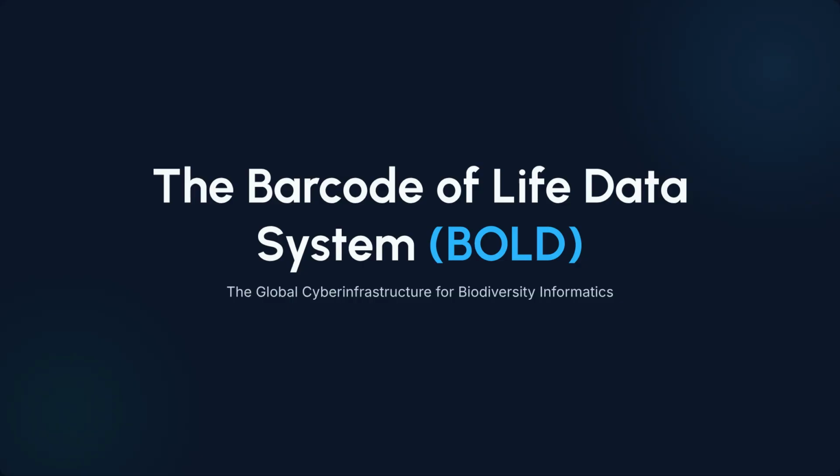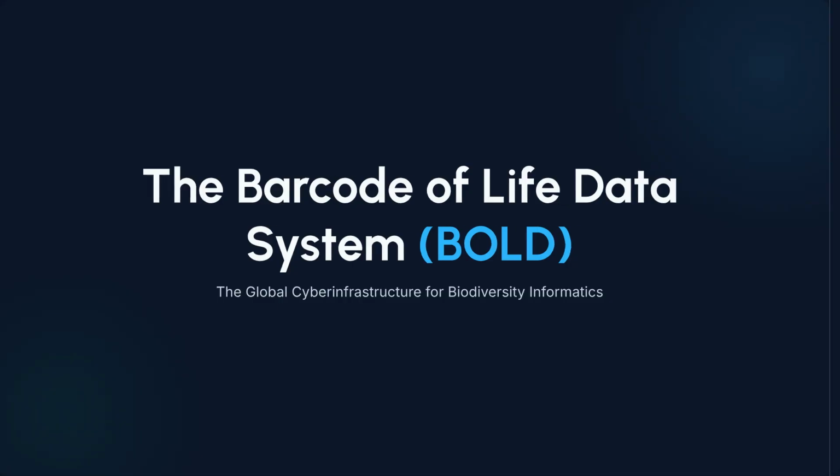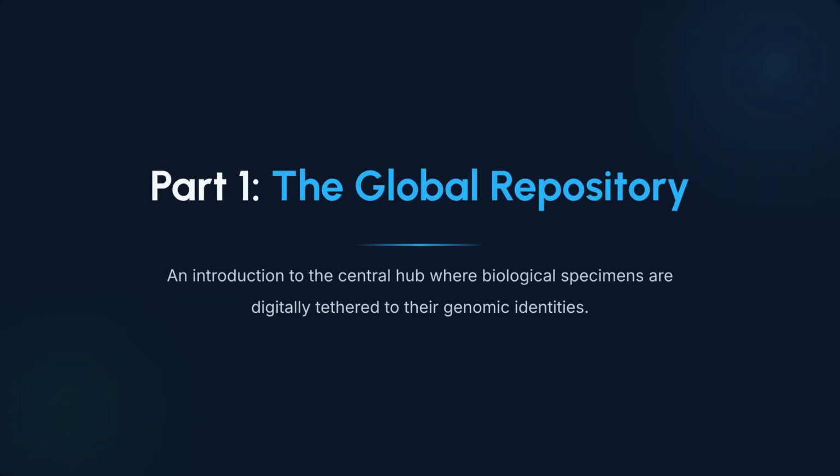Welcome to this video on the Barcode of Life Data System, or BOLD, a global cyber infrastructure designed for biodiversity informatics. We begin with Part 1, the Global Repository. This is the central hub, where biological specimens are digitally linked to their genomic identities.